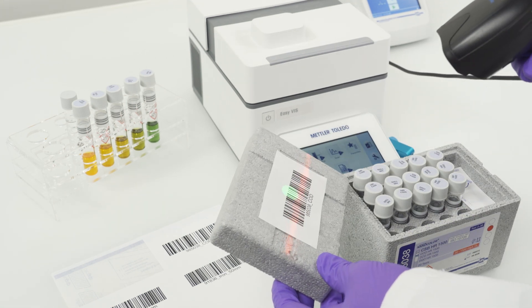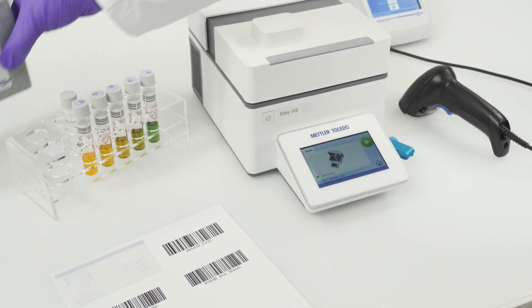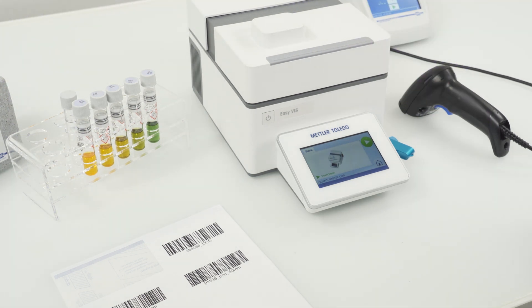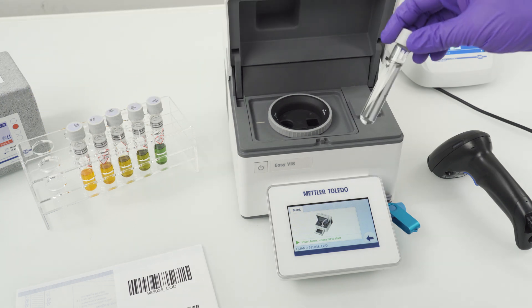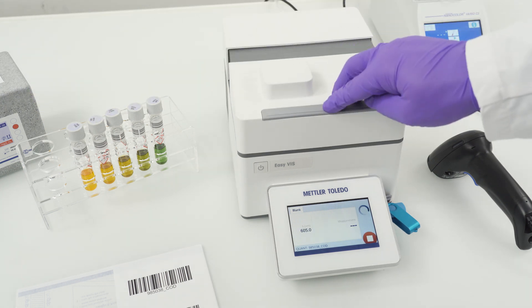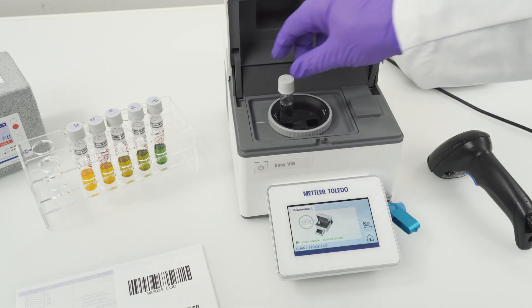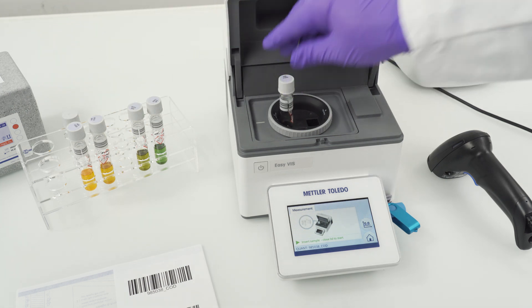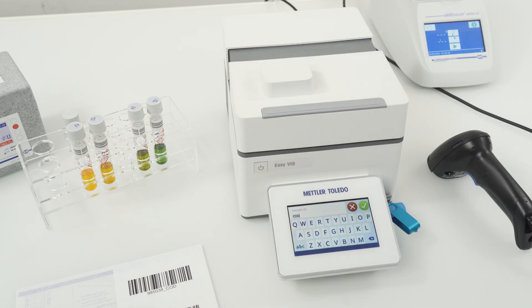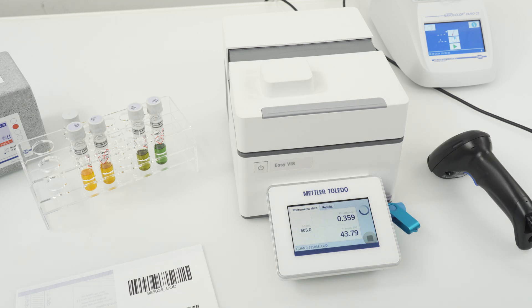By scanning the barcode the method starts automatically. You will then be guided step by step through the measurement procedure. First, insert the blank and close the lid. Once the blank measurement is complete, you will be prompted to insert the sample. The result is then displayed on the screen.